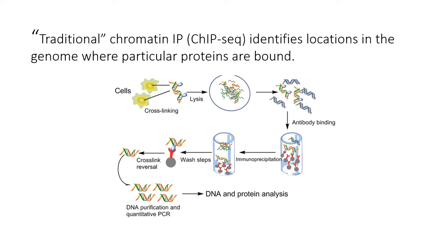So having cross-linked, shredded our DNA complexes, bound our antibody, and precipitated them, we then centrifuge, and then wash, and then we reverse the cross-link from the antibody, and then sequence the DNA that we get out. So ultimately, we're sequencing the DNA that was associated with the protein of interest. So the antibody was against the protein we're looking for, but we're determining where it was by sequencing the DNA that came down with the protein antibody complexes. Complicated enough?